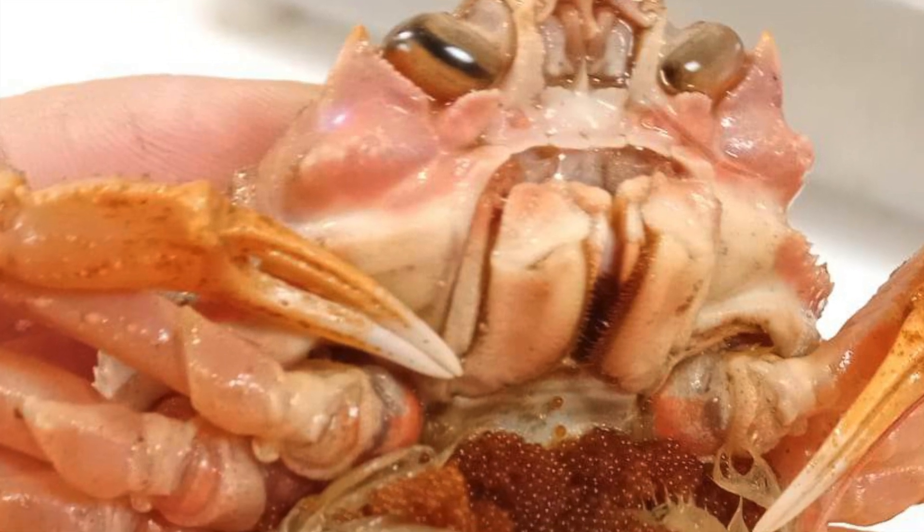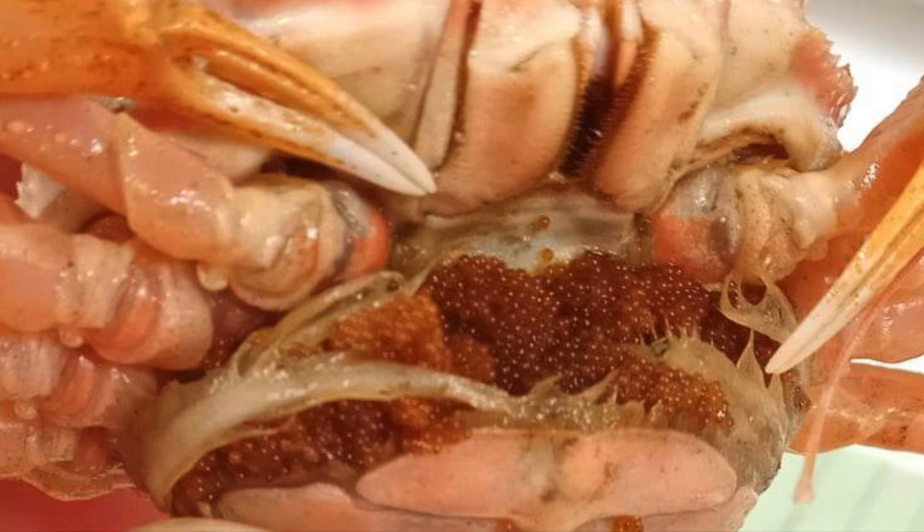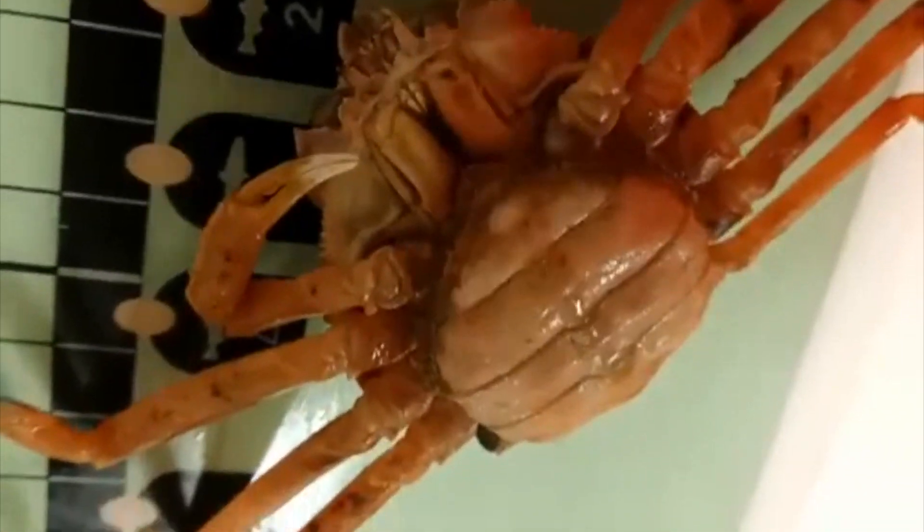This video will explain how to distinguish each of the three main developmental stages of snow crab eggs. The eggs are stored on the pleopods, which are beneath the abdomen. To see the eggs you may need to take a knife and gently open the first segment.